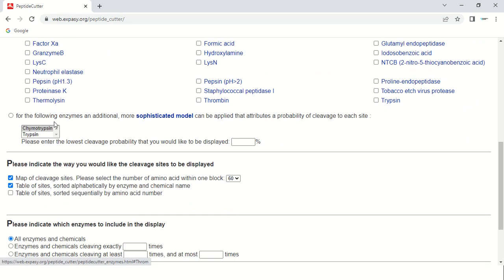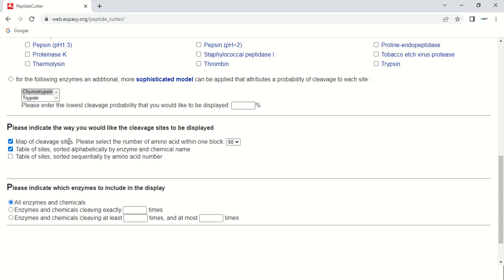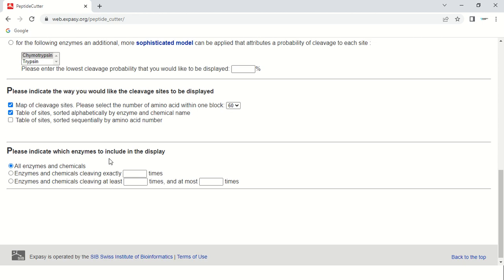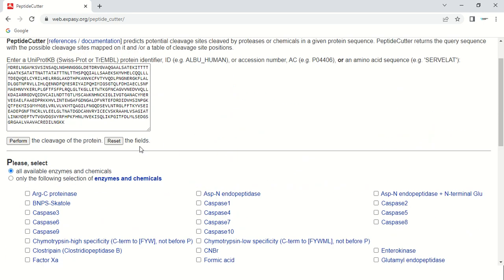If you scroll down, the next option lets you see only the sites of chymotrypsin and trypsin. There are also display options such as 'map of cleavage site' and setting the number of amino acids per block — currently set to 60 amino acids per block, which you can change. You can also have the table of sites sorted alphabetically or sequentially by amino acid number. These are the default options. Once you have chosen all your settings, click the 'Perform' button.